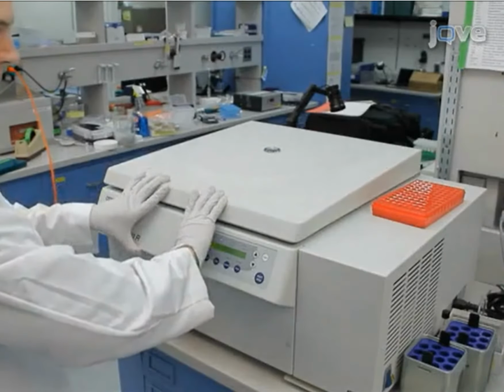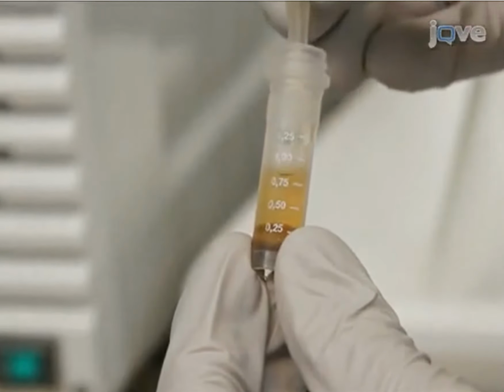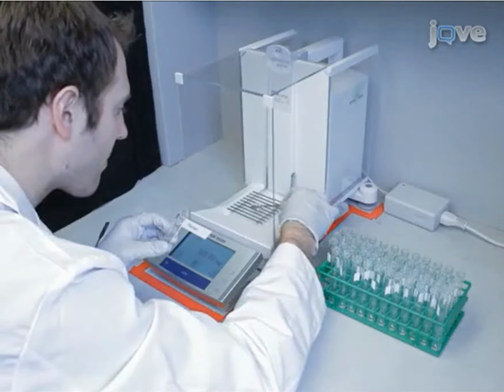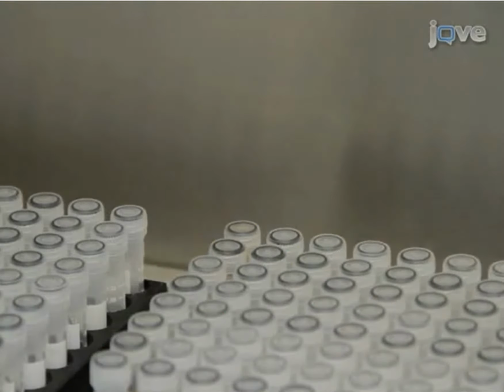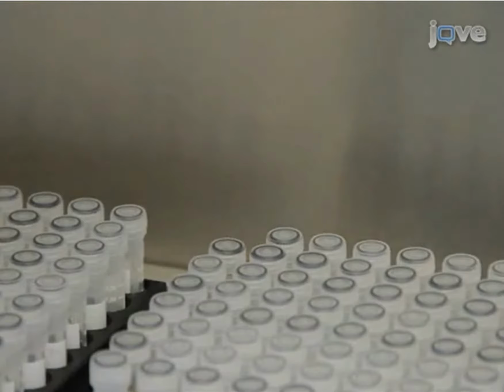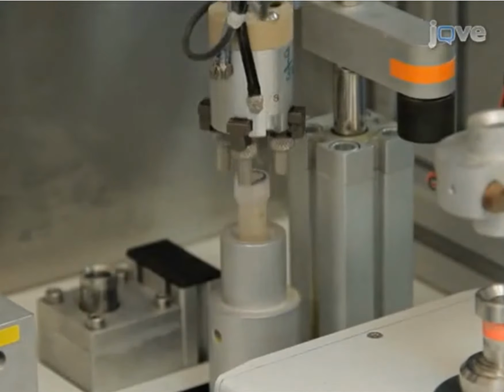Continue to isolate cell walls and remove residual starch as shown in Part 1 and described in the accompanying written protocol. Weigh out 2 milligrams of de-starched cell wall material into a 2 ml Sarstedt tube. A high-throughput way of performing this task is the iWall robot. The robot takes a tube containing ground plant material and pokes a hole in the bottom of the tube.